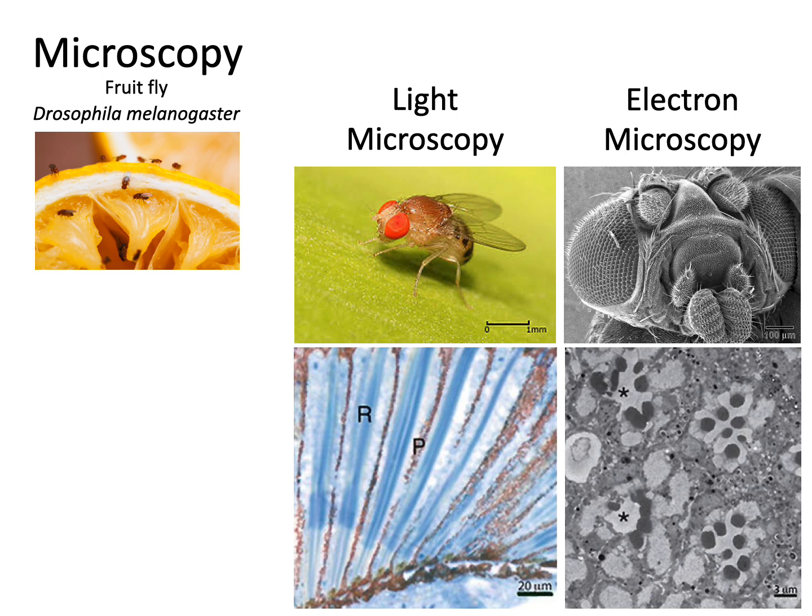The magnification is much higher, right? The scale bar in the upper left is a millimeter, whereas the scale bar in the lower left is 1/50th of that, right? 20 micrometers. So just very crude ballparking here, it's about 50 times as powerful as the whole fruit fly, looking at just these kind of structures within the eye.